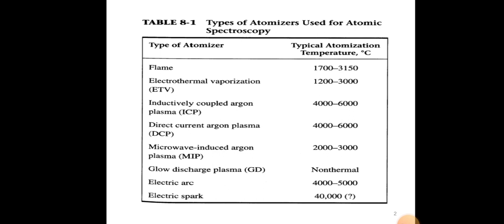There are many different atomization methods which are used in atomic spectroscopy. In this table, you can see the most important ones.